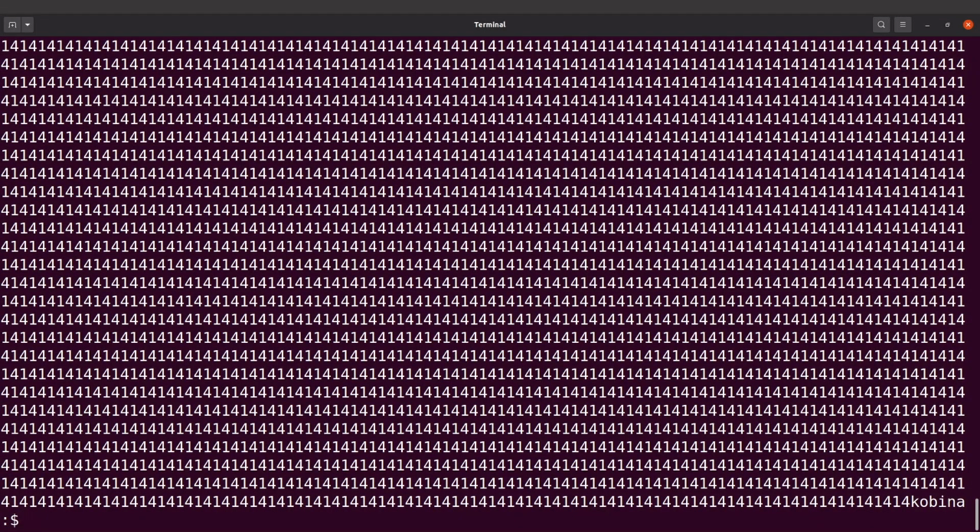You'll notice that we have the chromosome also being displayed, but you can see that we have lots of numbers, which will sound confusing. If it's chromosome, we expect at least there will be some clarity here, whether it's chromosome 1, 2, 3, 4, but this is what we see here. So this is just bounded up and it's kind of messy. So we are going to improve this code. We are going to modify it a bit and then rerun the command.